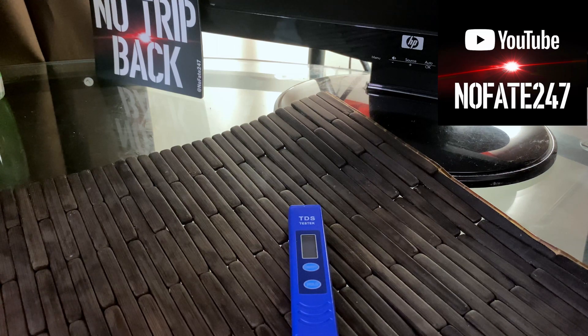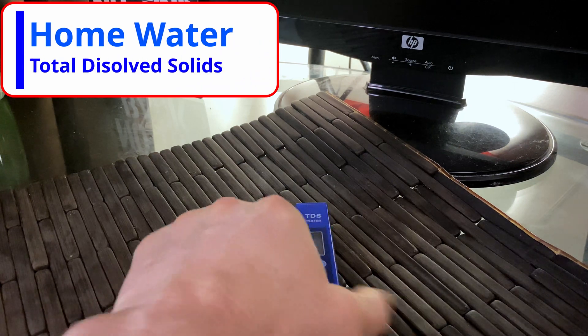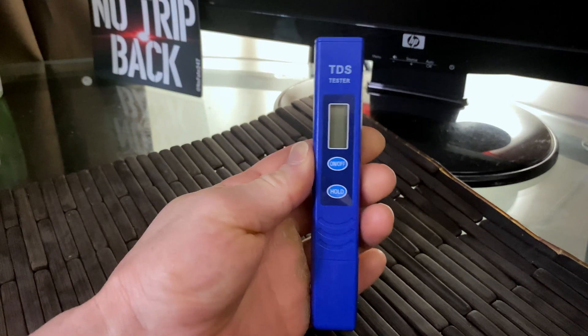The NoFate Channel, checking in. Today we're going to be talking about your home water quality, how you can test it, what a TDS meter is, how I use it, and how to change the battery on this thing.